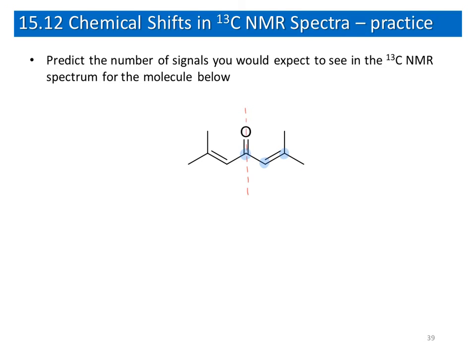However, right now, we have a double bond, and we know that we don't have rotation about the double bond. So these 2 methyl groups should be different from one another. However, this plane of symmetry makes this methyl exactly the same as this one. Both of them are closer to the carbonyl group. Basically, we say that they are cis to the carbonyl group.